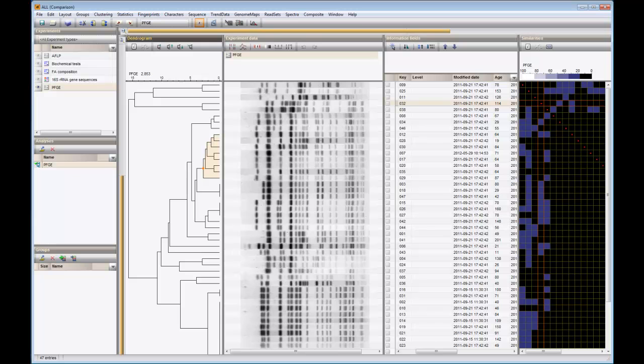In this demo, I will show some display and edit functions in the comparison window. The tree shown in this comparison was calculated from pulsed field gel electrophoresis banding patterns using the distance coefficient number of different bands.